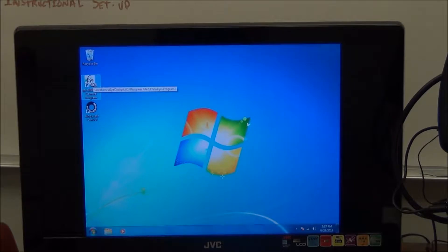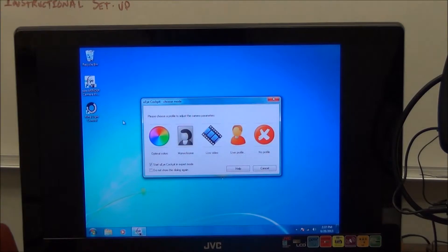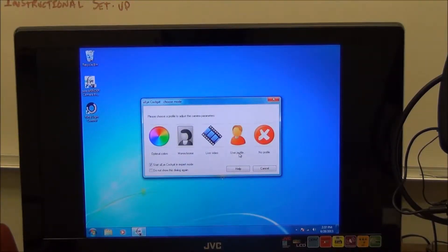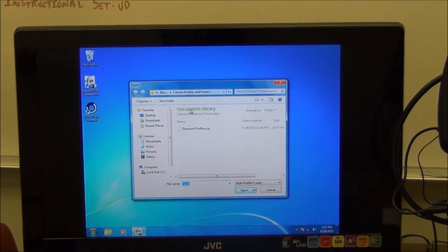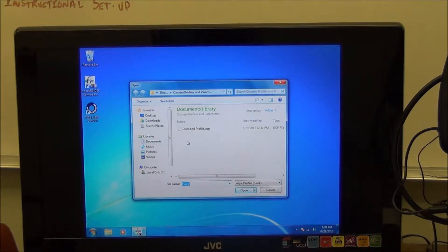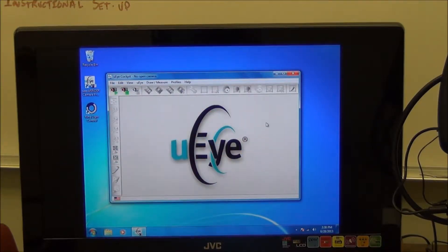We'll go ahead and open the SpecFinder camera software by double-clicking on it. You'll have several options to open the camera, and what you want to do is open the user profile. The user profile contains certain camera settings that have been stored — you can change these depending on your own application and preferences. We've loaded some settings and called them diamond parameters. Click on that and a dialog box opens, stored under the document library on Windows 7, where you'll see the diamond profile. Open that profile and it takes you into the actual camera software.